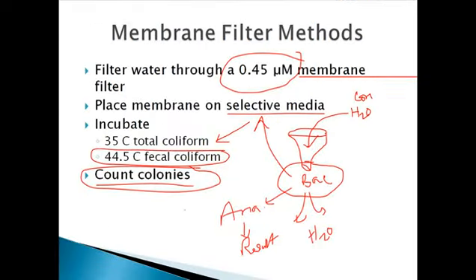So we can conclude after this kind of experimental setup. Okay, this is a direct type of experiment with the filter method, so it's a good, reliable method to do that. But some microorganisms can pass through this membrane filter. This check is possible for different coliforms, but there can be viruses and smaller microorganisms that can pass through this diameter of filter range.